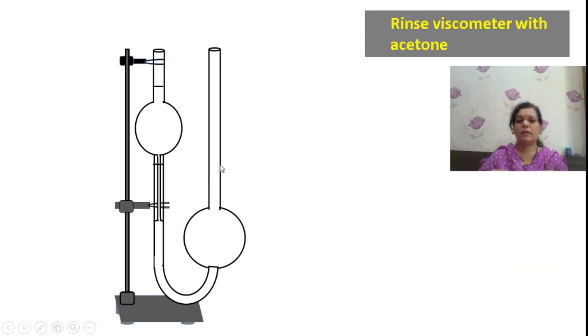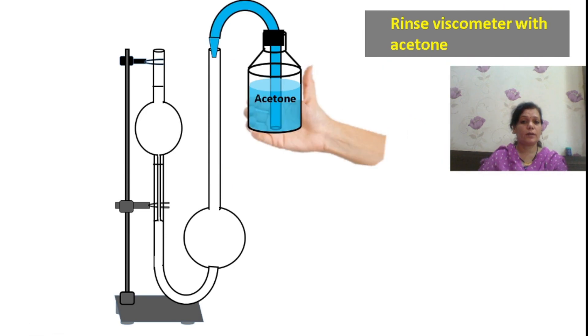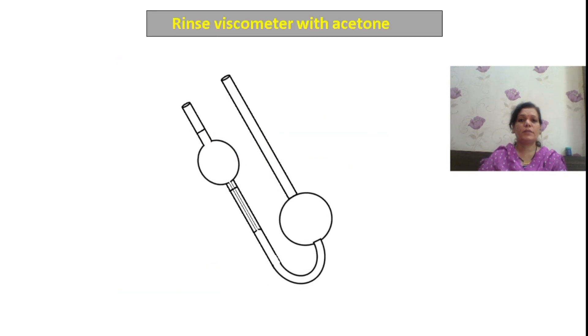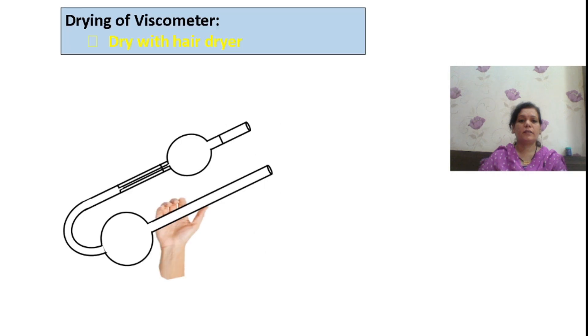You have to take care that you are rinsing the viscometer, cleaning the viscometer with acetone, an organic solvent, highly volatile. You will rinse the viscometer, tilt it, dry it with hair dryer.